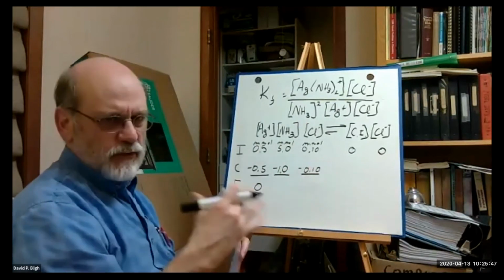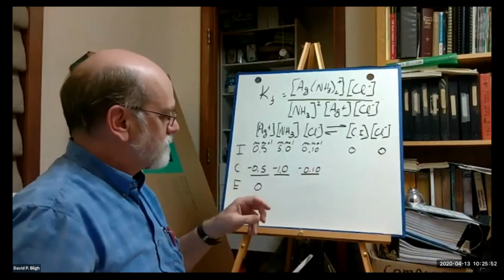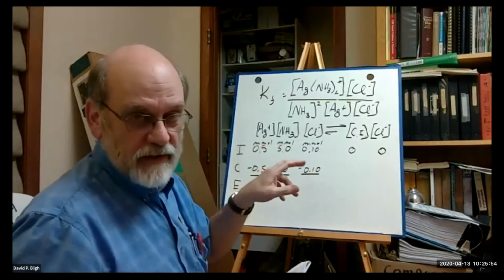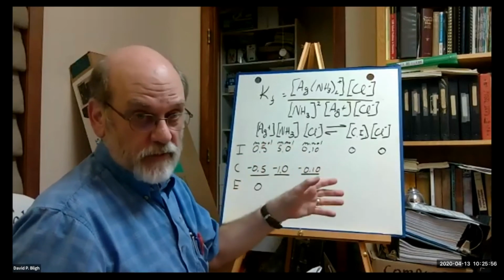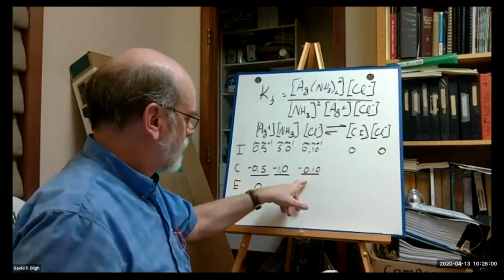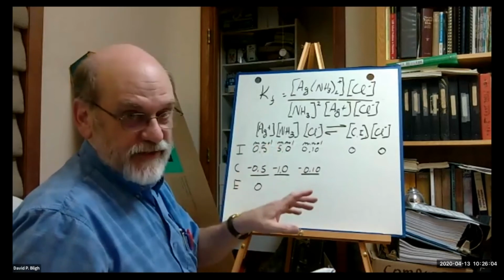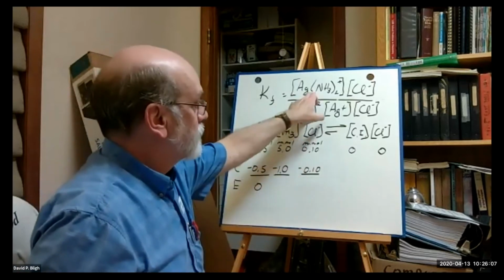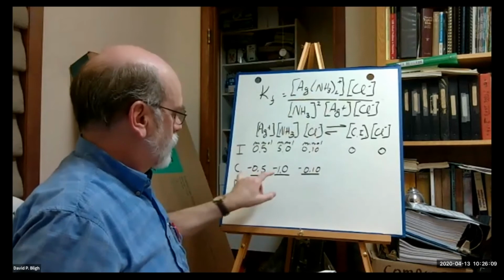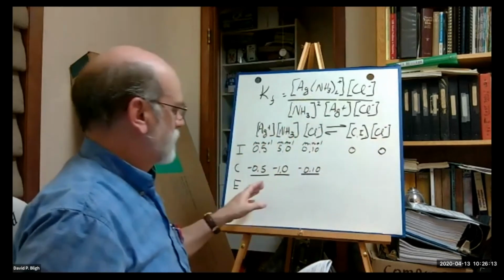Remember, we've got a coupled reaction here. So there are 2 things going on. In the titration, every time we add chloride, it reacts with silver, whatever silver's floating around. But where is it getting that silver? It's getting the silver from here, right? We formed it from here. We're using it up here to go to there, right?